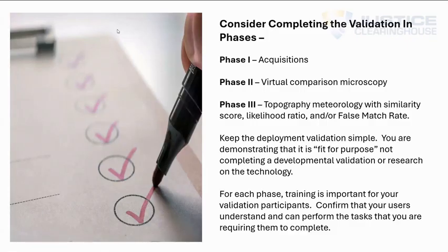For each of these phases, though, training is of the utmost importance. I've seen a lot of validations fail because the validation participants aren't completely trained on how to use the technology for the purpose in which you would like to use the technology. So confirm that your users understand and conform to the tasks that you are requiring them to complete.